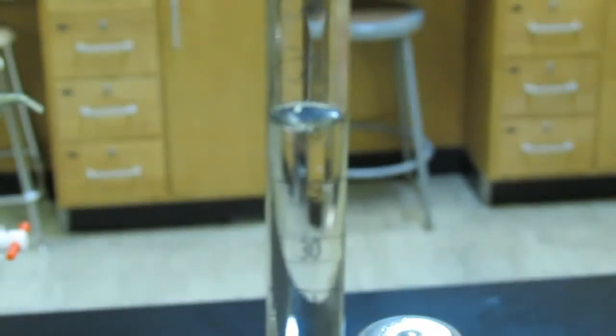And then we'll swing around and do the same thing for my final acid reading. And let's take a look. See what we get for our final acid reading. Let's position this so we can read it. It's best, of course, to get eye level with this, and I'm doing the best I can with my camera here. We're not getting very good focus here. Let me zoom back out just a little bit. See if we can get that. Okay, it looks like it's between 27 and 28. So we're going to call it 27 point. Let's see, 27.85 would be my final acid reading.